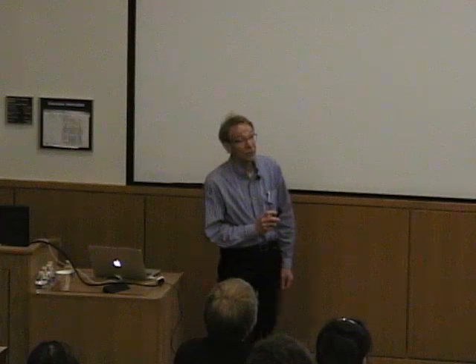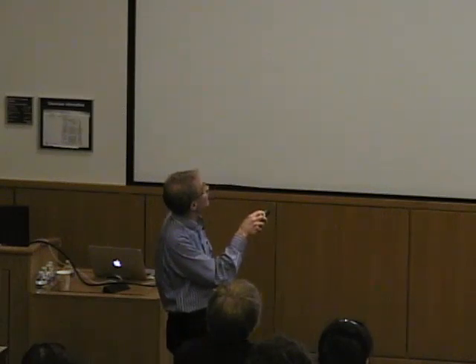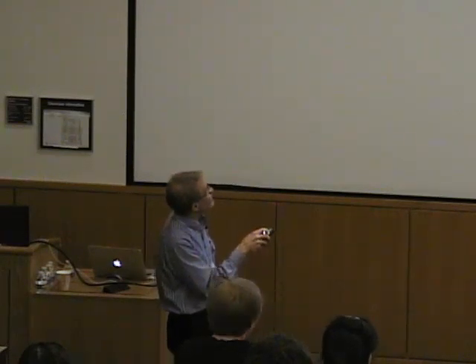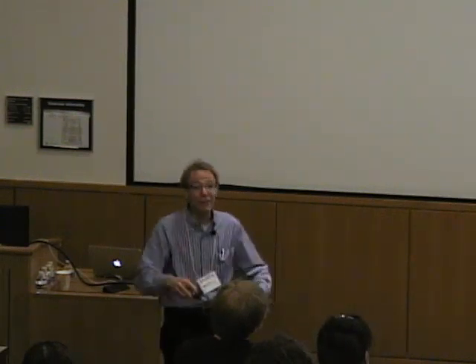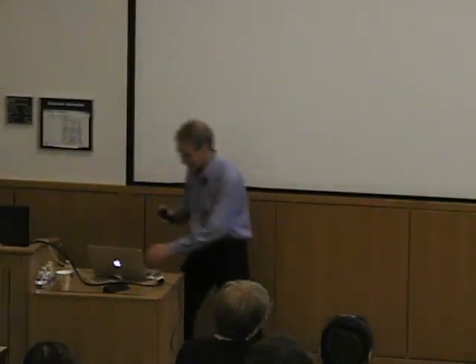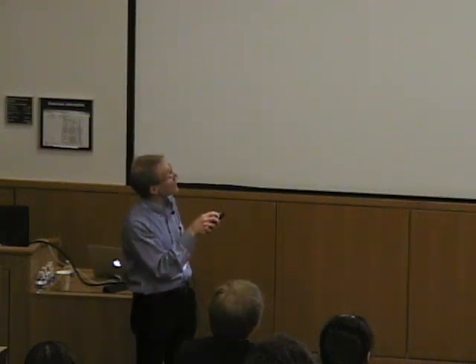So 2 years ago, I gave a talk. It was 90 minutes, so I had a lot of time, and we went into a lot of details about calorimetric methods in biomolecular science, ITC. We talked about several examples of cases that are of interest to this community, and we even touched a bit on differential scanning calorimetry. But this time, because I only have 45 minutes, and because that talk was posted, we're going to be a little bit more selective. What I'd like to do is focus only on ITC.